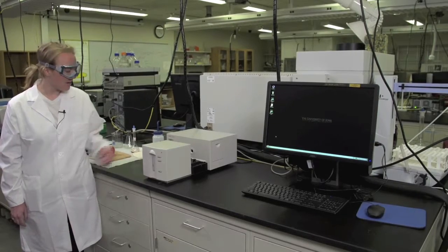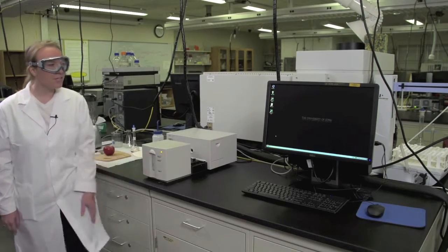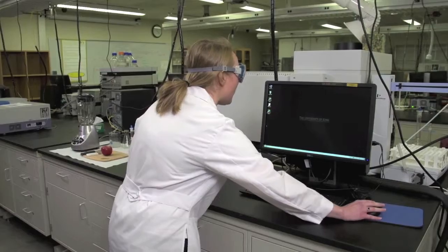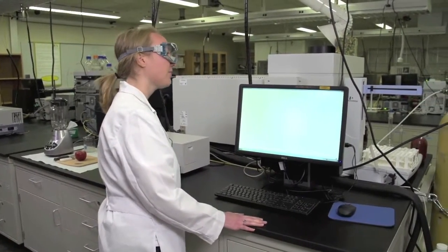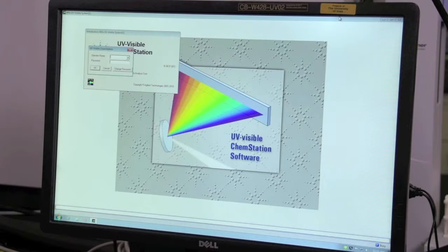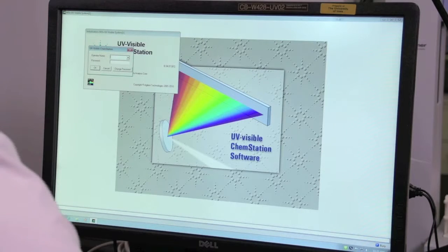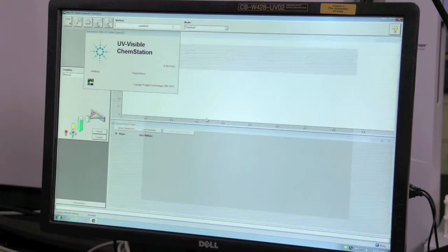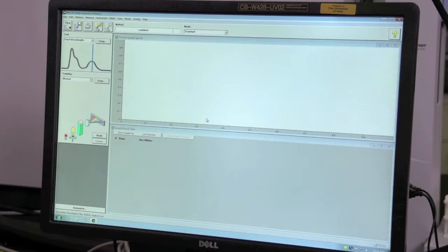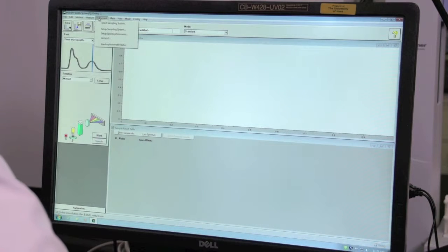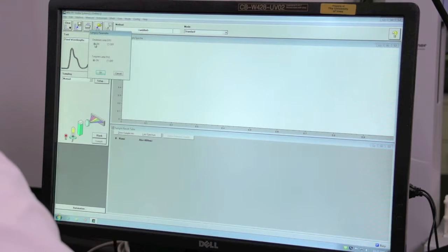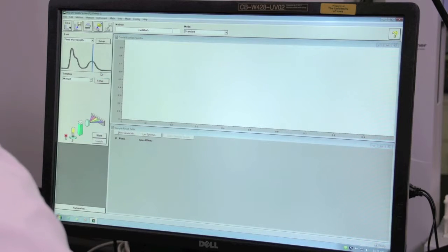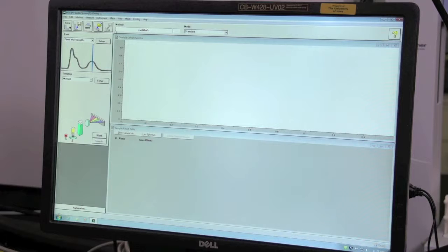When you get to lab, first turn on the UV visible spectrometer, then go to the computer and turn on the instrument online software. When the dialog box prompting the operator name and password appears, click cancel and wait for the software to load. Once loaded, go to Instrument, click on Lamps, and make sure both the deuterium lamp and tungsten lamp are turned on. You'll want to wait at least eight minutes to let the lamps warm up.